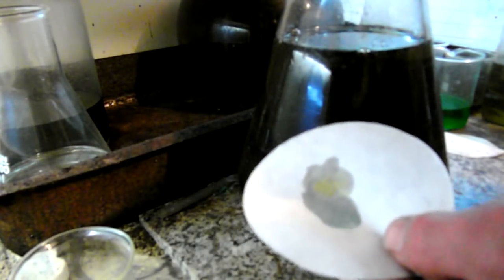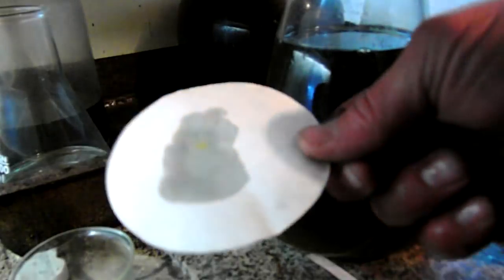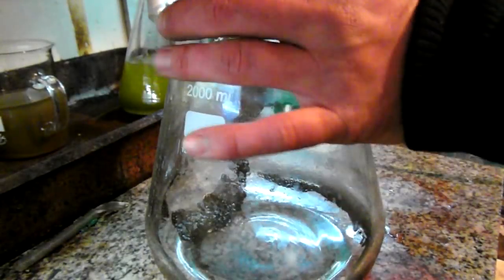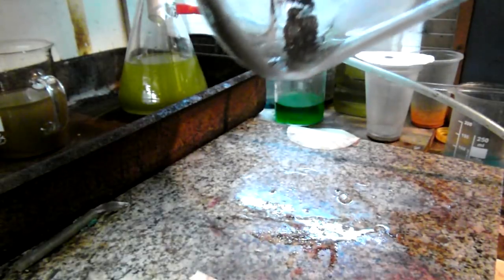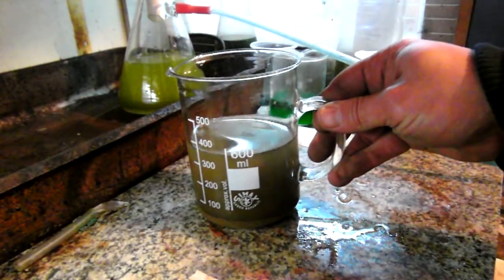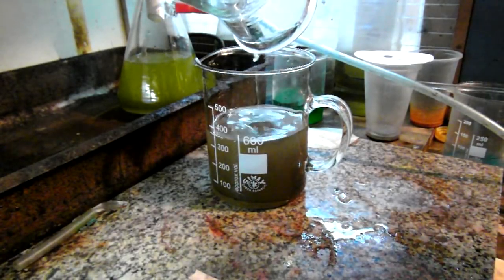Negative. I've decanted the barren liquid and collected the powder in a small beaker.